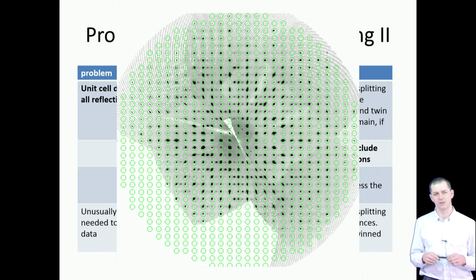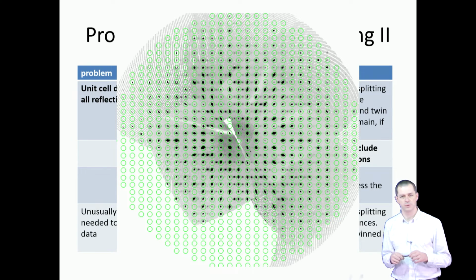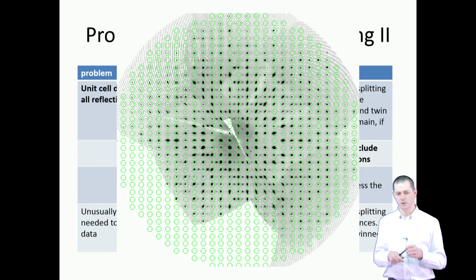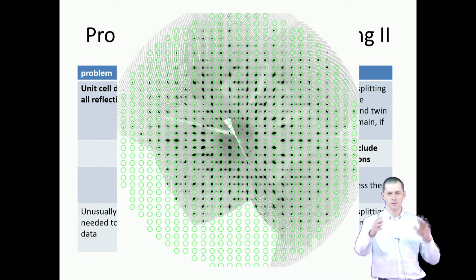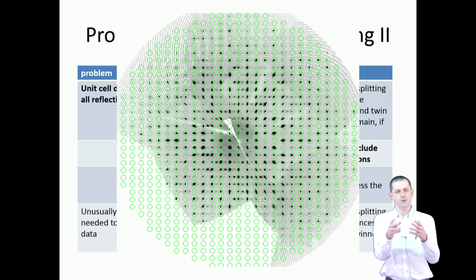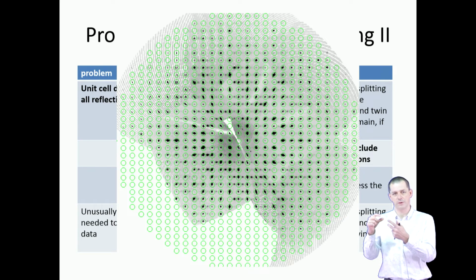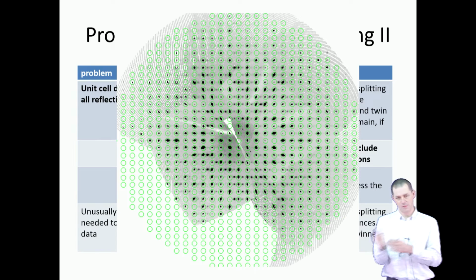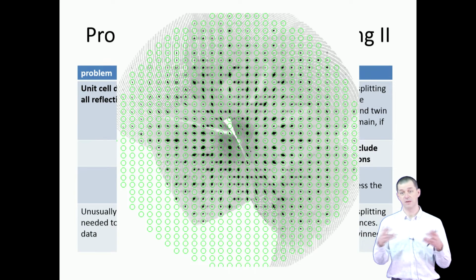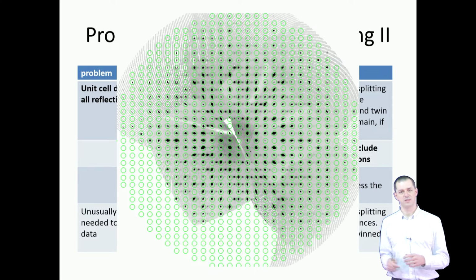And there are many such structures in the crystal structure databases, especially from the old days when the structures were measured by point detectors. At those days, the data collection worked like this. First, the reciprocal space was randomly searched for reflections. So the diffractometer just made essentially a random or systematic search in reciprocal space, blind. There was a point detector, so it was only either counting signal, or there was just background. And when the point detector found a signal, its position was recorded, and then when there were 10, 15, maybe 20 such reflections found, the unit cell was determined from these 20 reflections.